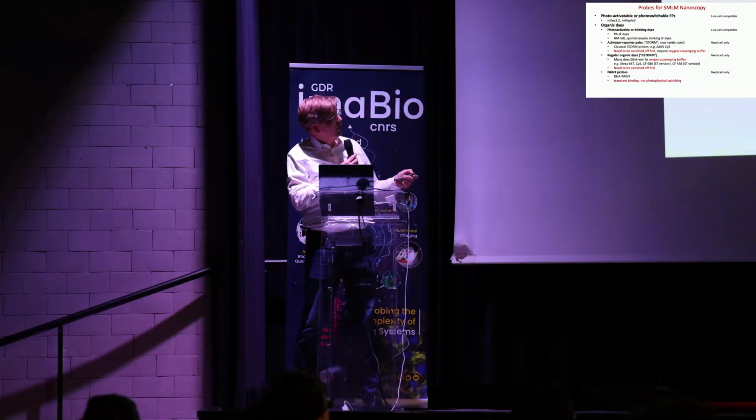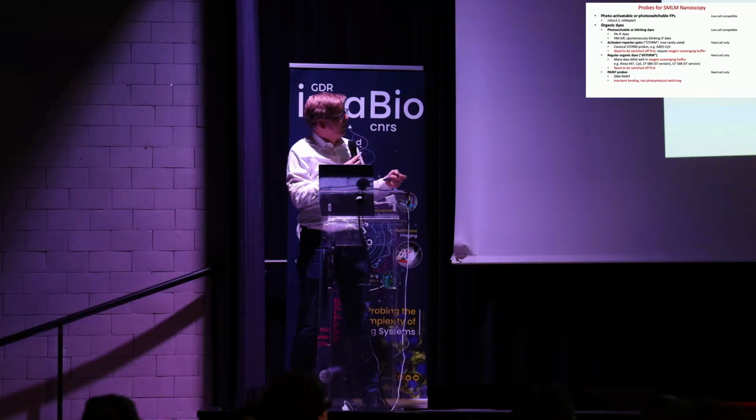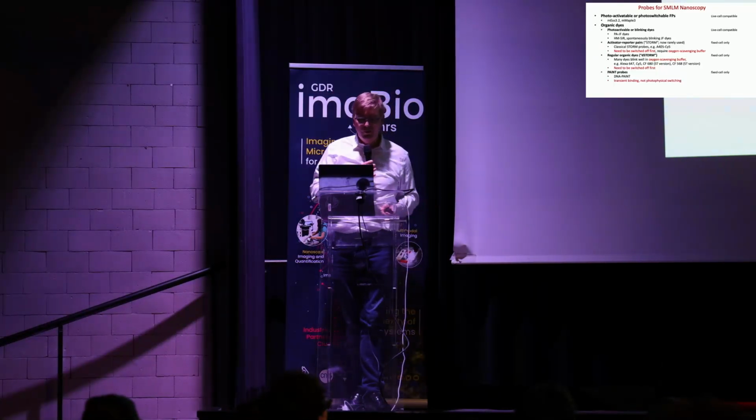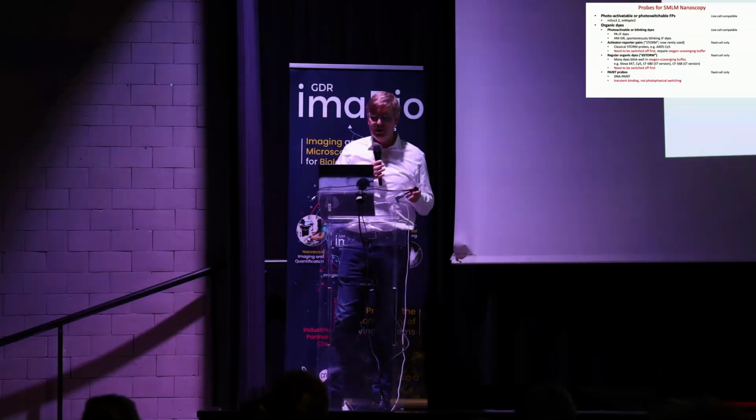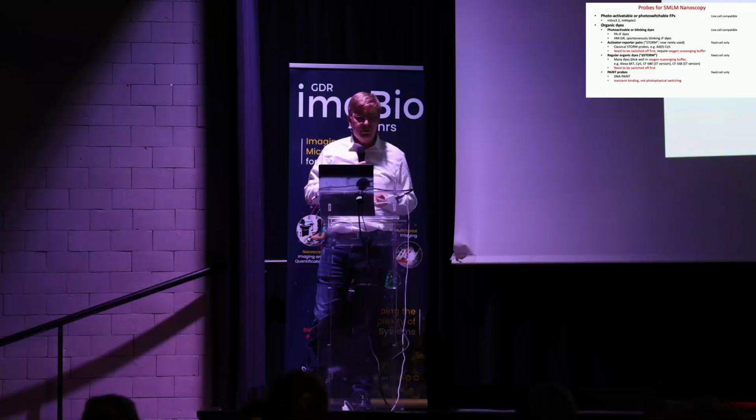So it's also interesting to consider which of these are live-cell compatible. I would say there are probably exceptions to these rules, but overall I would say it's primarily these top ones which are live-cell compatible. Most of the probes are essentially limited to fixed cell imaging with some exceptions, and most of the applications we see in the single molecule localization microscopy field are in fixed cells.